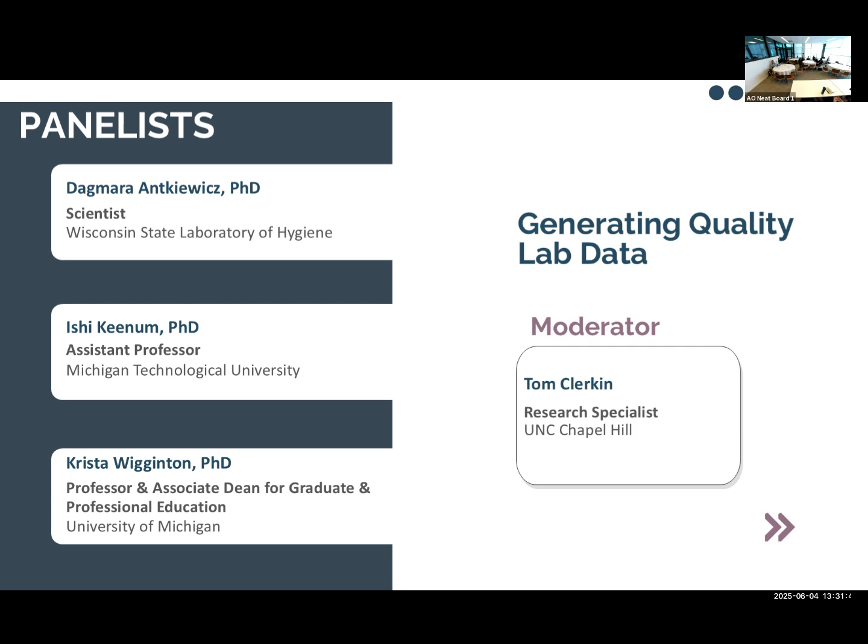It also might create supply chain bottlenecks. If we were in a situation where we all needed it right now and we are all ordering the exact same kit and none of us have ever done it with any other kit, you can create problems so that all your sites are down instead of just a couple of sites. You also want to be cognizant that every lab and state has different resource constraints. If we're developing methods for SARS-CoV-2, those might not be the same as methods if we want to do AMR, right? That's a very different target.